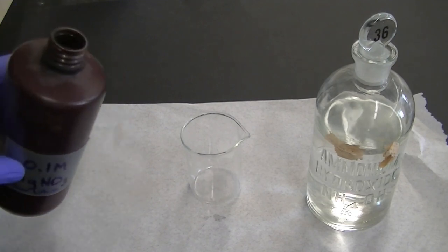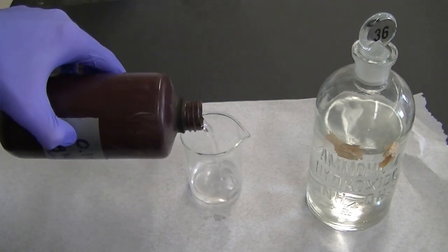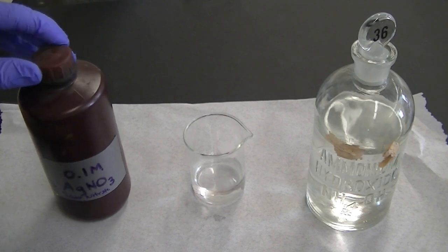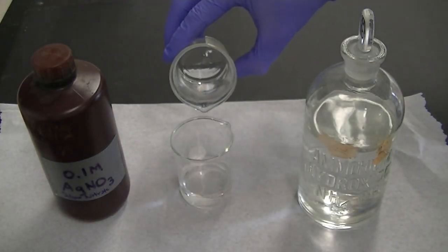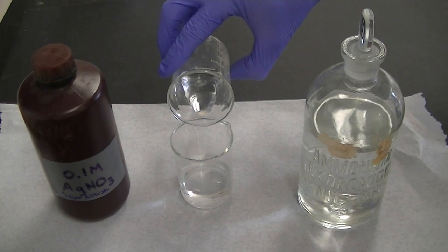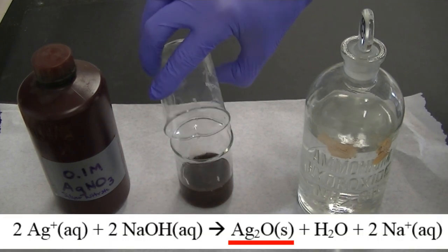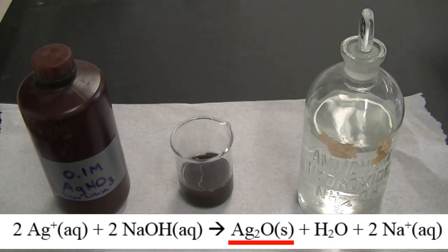To set up the experiment, I took a solution that contained dissolved silver ions. The reaction works better in a base, so I added a solution of sodium hydroxide to the dissolved silver. Notice that this formed solid silver oxide, which is black-brown in color.